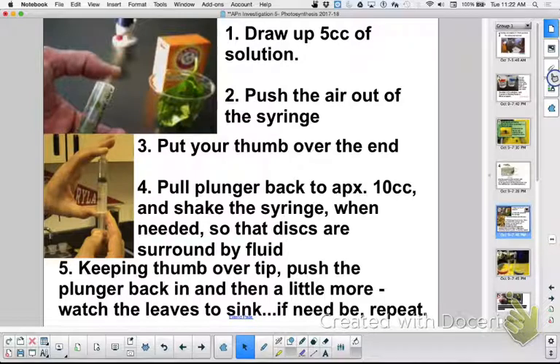I would make sure that I got all the air out. I would again put my thumb here, pull back. While I'm pulling back, I shimmy, shimmy, Cocoa Puff. That probably works. Okay. And then I just sit here and tap. When I've got both of these good, when I have both of them so that they sunk, now I'm ready to move forward in the lab.